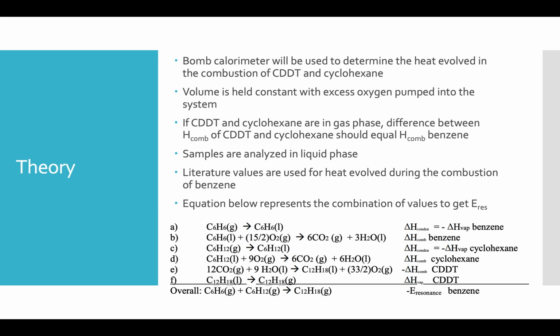Another important factor that influences the final result is enthalpy of vaporization. The sample molecules are all analyzed in liquid form. During combustion, the molecule is vaporized. Because each molecule has a different enthalpy of vaporization, this needs to be included in the data analysis as well.